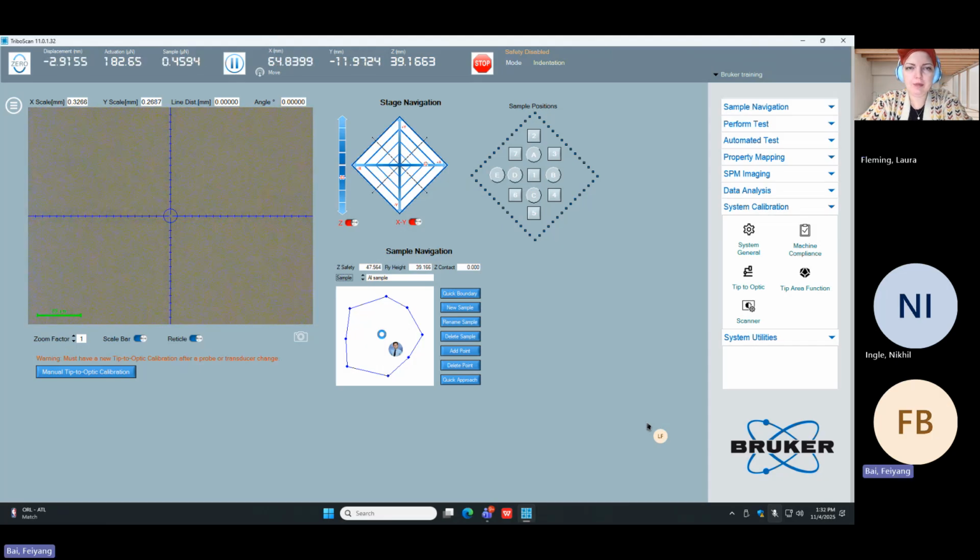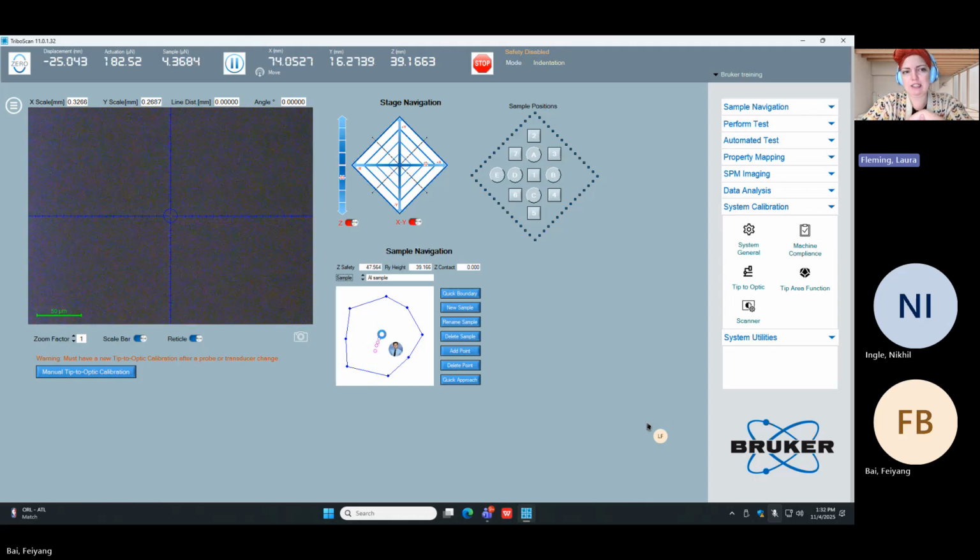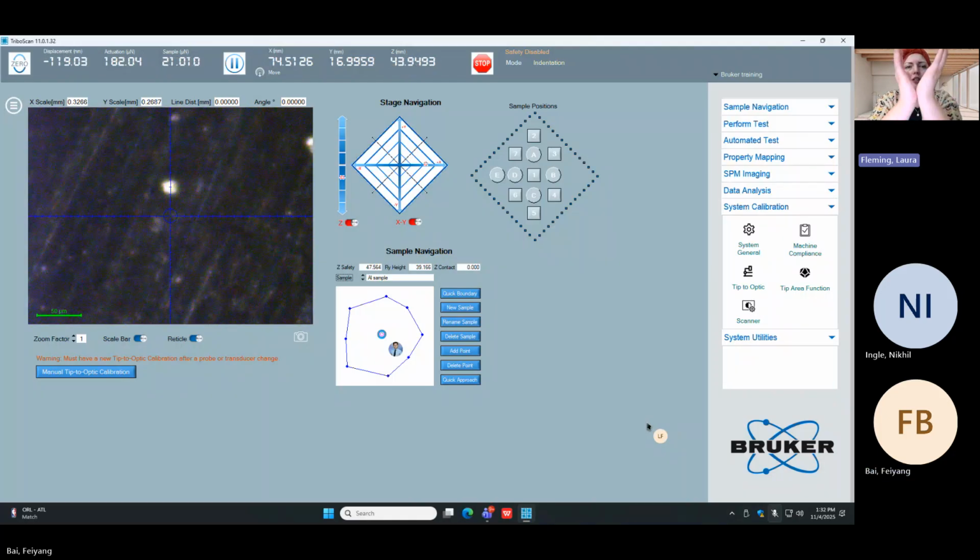Yes. And you will not see them on the fused quartz, even on our systems with 50x optics. Yours is a 10x. Even on those 50x optics, I cannot see the indents in fused quartz. They only go the residual depth. I think the biggest one is going to be like 250 nanometers deep, versus this, which will at least go 500 nanometers. And it's mostly plastic deformation and it's shiny, so we'll be able to see it well.